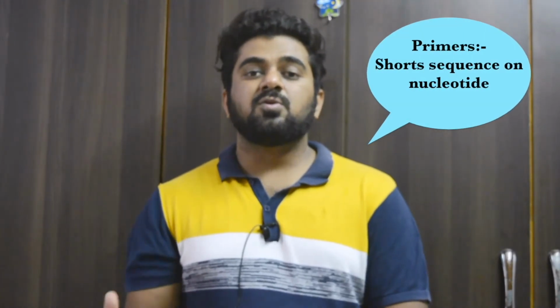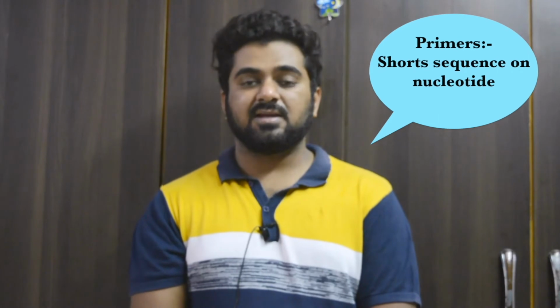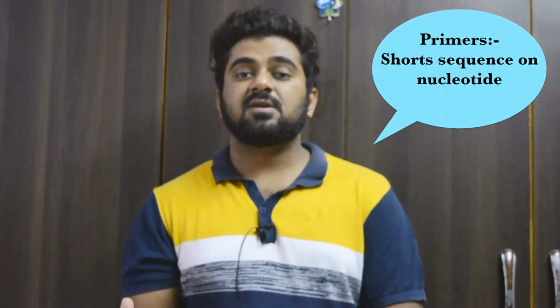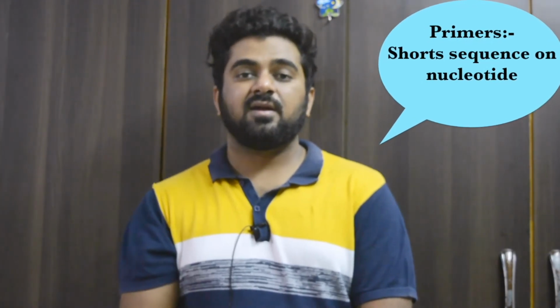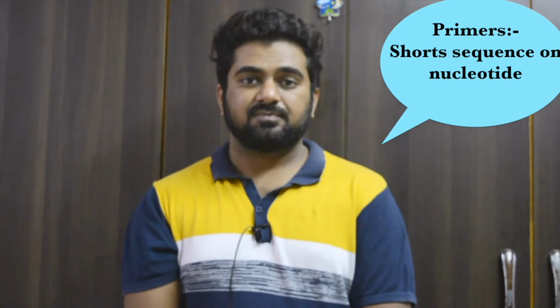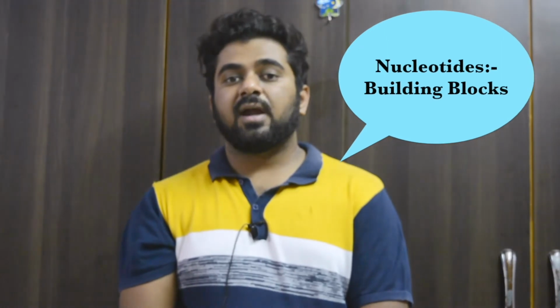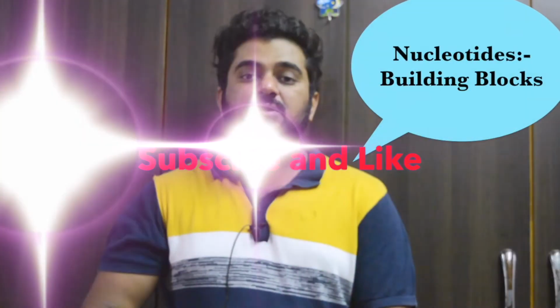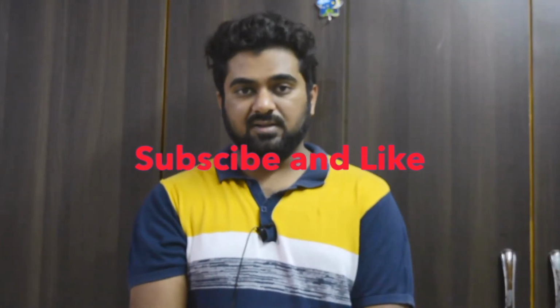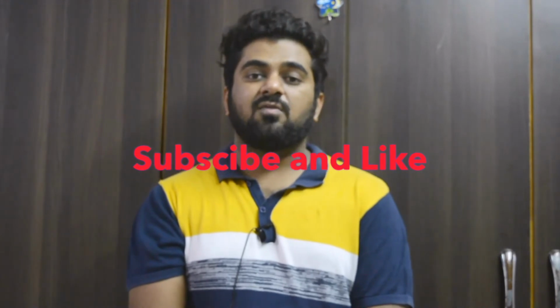Then primers. Primers are specific short sequences of nucleotides, right, which will be used as a starting point for the DNA replication. They help in identification of the specific DNA region or specific target DNA which we are going to replicate, right? Then nucleotides are the building blocks for the DNA synthesis process, right? So all these components will be added to the thermocycler for the processing of PCR.